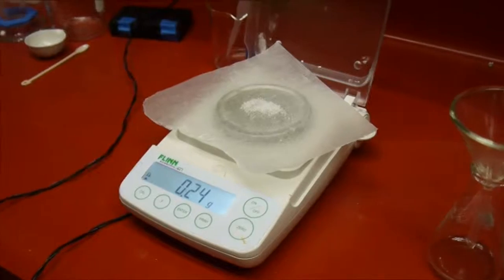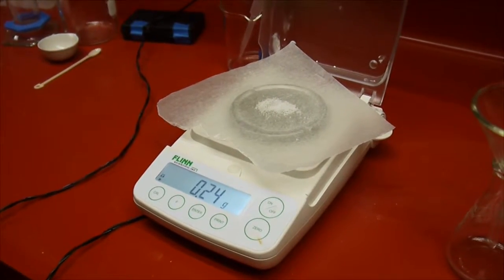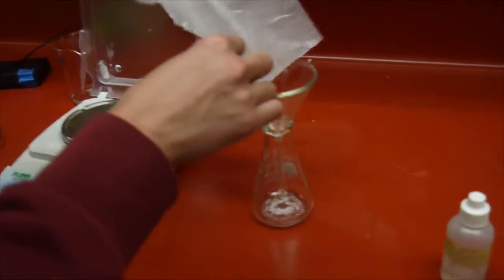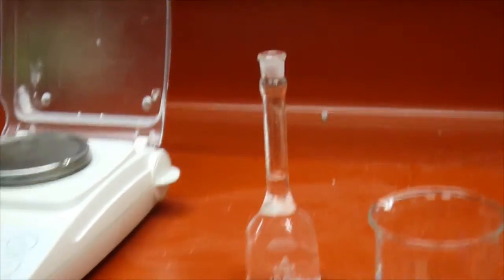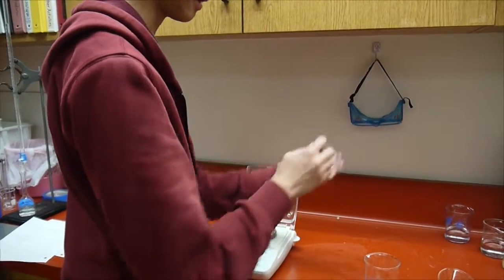Creating your solution. To create your acid-base solution, use a scale to weigh the correct amount of acid or base needed to make X molarity solution. Then create your solution by putting the substance into the volumetric flasks, adding the water to the 100 ml mark, then mixing it well. Do this for both solutions.